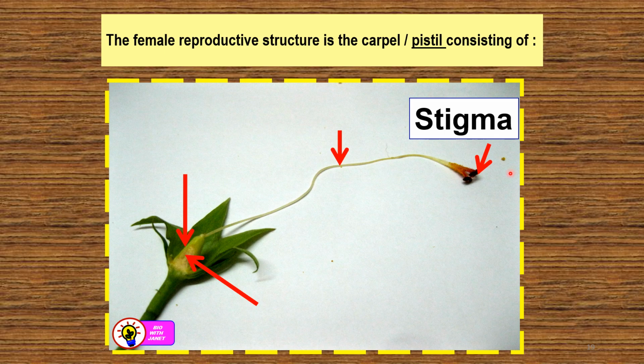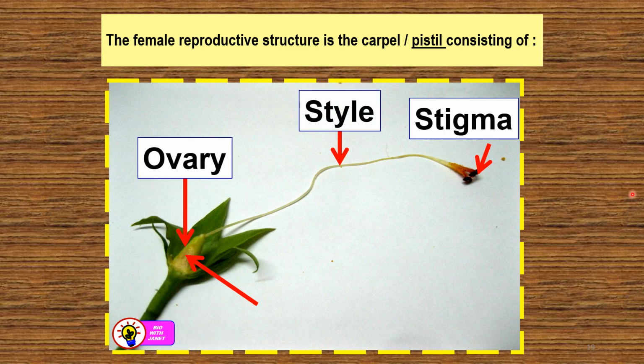and I've cut open the staminal tube carefully in order to release the style, which is quite long and thin. Okay, so this is the style, and then next you have the ovary, and finally inside the ovary there is the ovule. Okay, so if you are doing dissection of the hibiscus flower, try and get this whole carpel out of the flower.